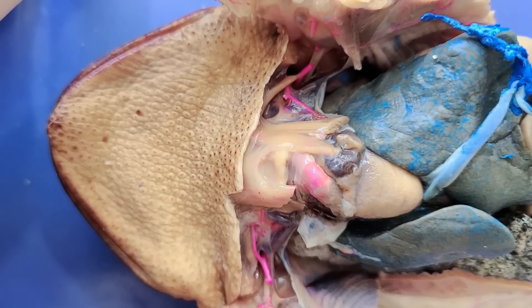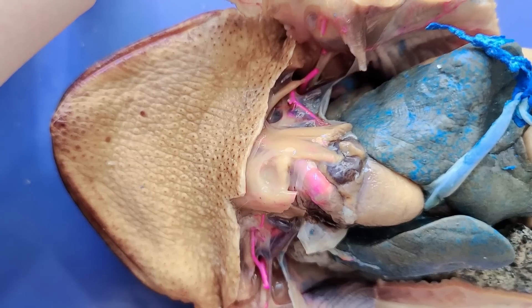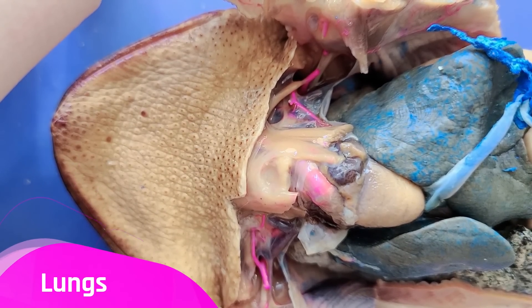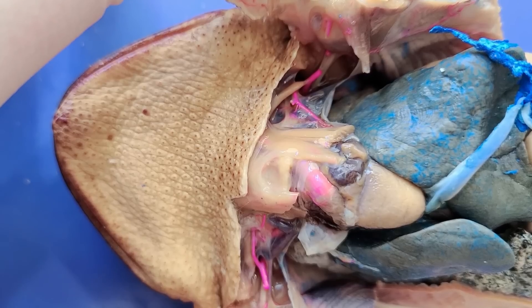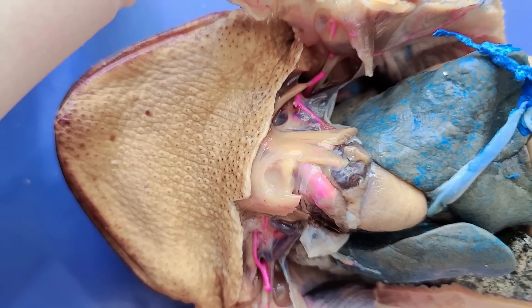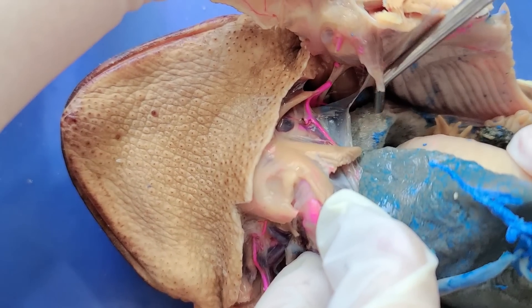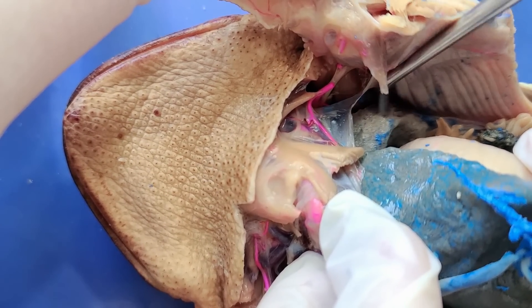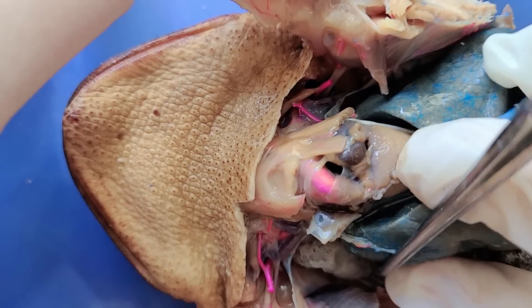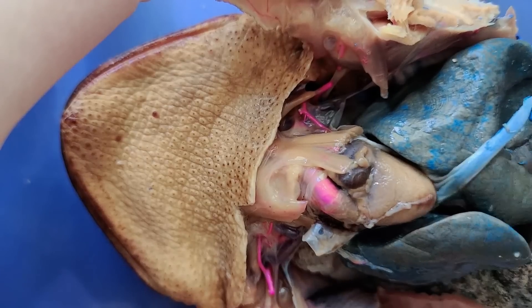While toads can use their skin to absorb oxygen, they also use their lungs to supplement their oxygen supply, especially after strenuous activity. You can see the lungs here — these spongy grey structures right here, and another one on the other side, so on both sides of the heart.